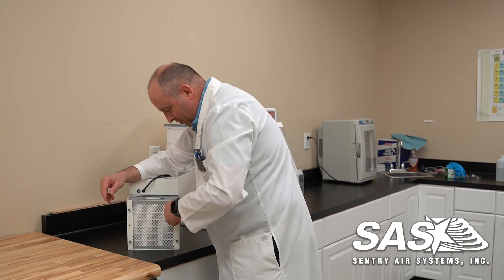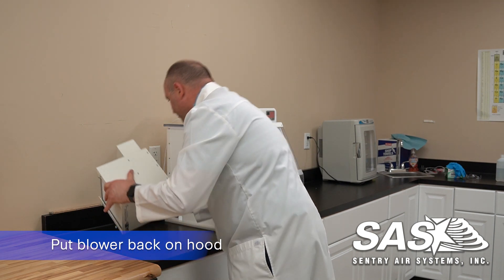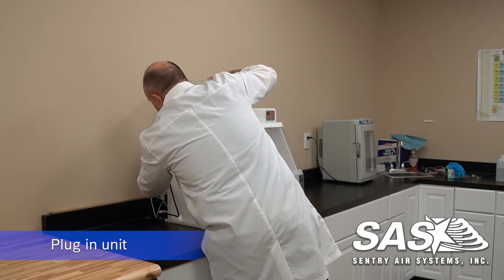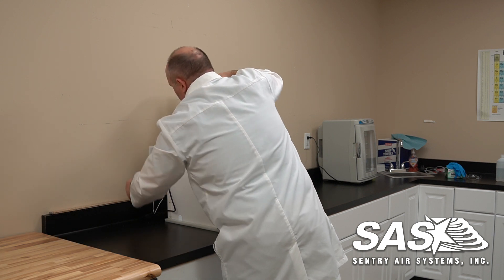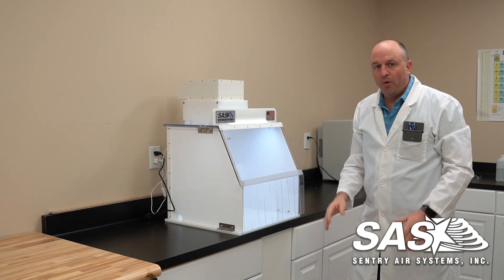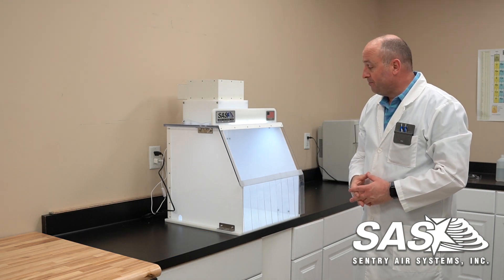Once we have these in here, just make sure they're snug. From here we're just going to put the lid back in. Plug the blower in and plug the light in. From here we can turn this on and turn on the light. We recommend waiting 20 to 30 seconds approximately to blow out all the dirty air, and then that will maintain your ISO Class 5 environment. Thank you.